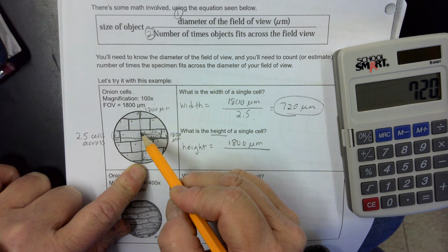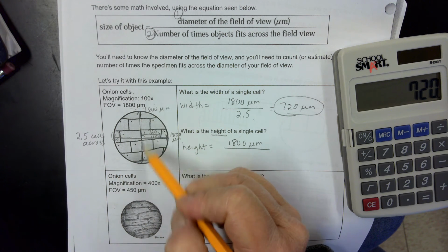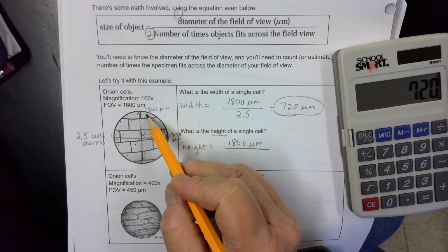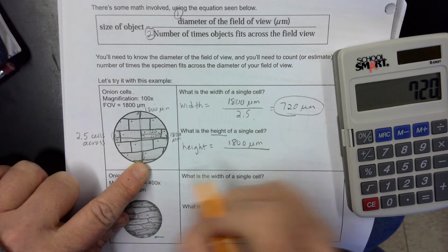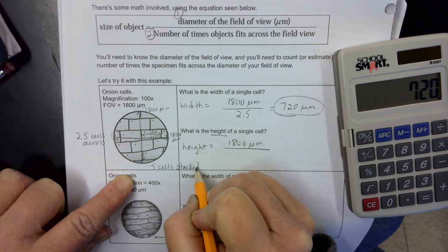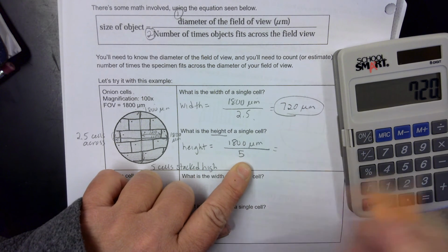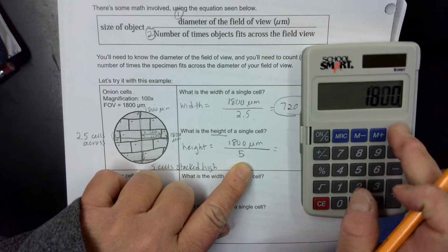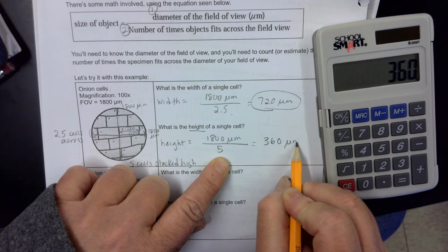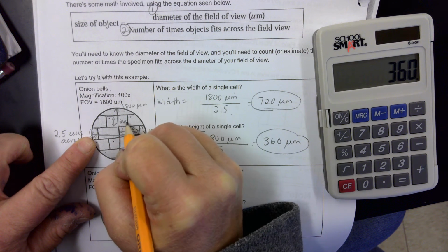I've got 1 full cell, 2 full cells, 3, 4, plus a little bit more, and if we patch those together, I'm going to say that that's equivalent to a full cell height. So we can fit 5 cells stacked high. So 1800 micrometers divided by 5, 1800 divided by 5, and so it looks like the height of each cell is about 360 micrometers. So this height right here is about 360 micrometers.